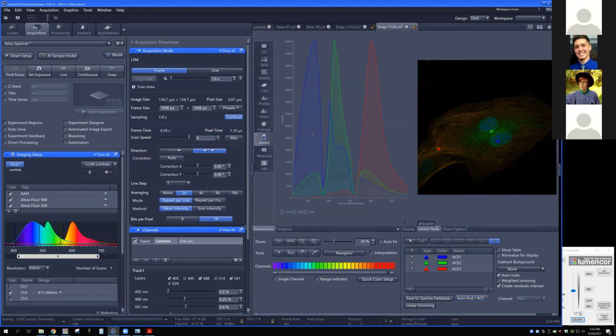In terms of looking at these curves, you can see that they're kind of like the emission curves that you saw in the talk earlier, except that they do have this little cutout in a couple of different places. And this is that notch dichroic, basically cutting out signal at those two different spectral bins that we collected. But that's okay, it doesn't matter, because we're going to factor that into the fingerprint that we just created here. It's a signature that's going to be unique to this microscope, but we can use this to unmix and we're going to see how well we do.